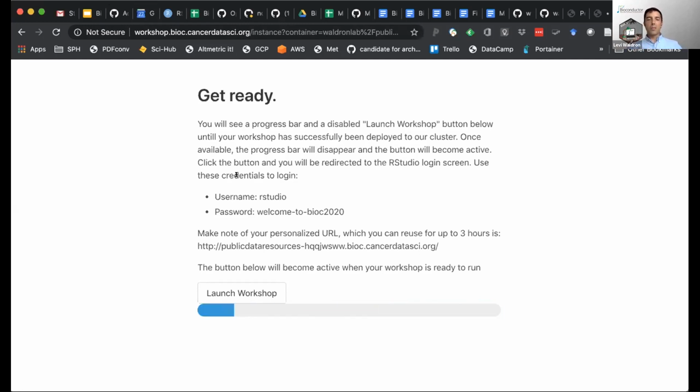So this is probably taking a little while because everyone is doing it at the same time and the cluster is having to auto scale up. Maybe I can bring you back, Sean, and let you talk a little bit about this system while we scale up.